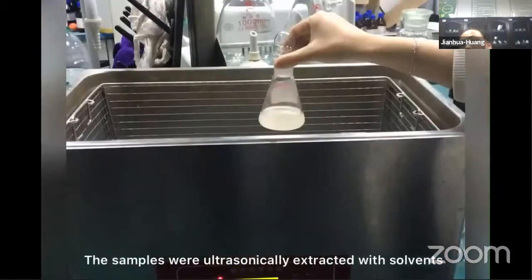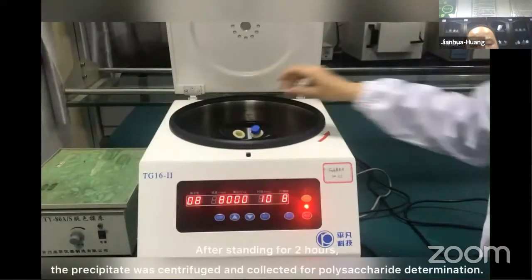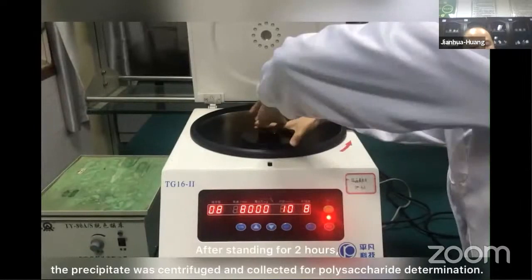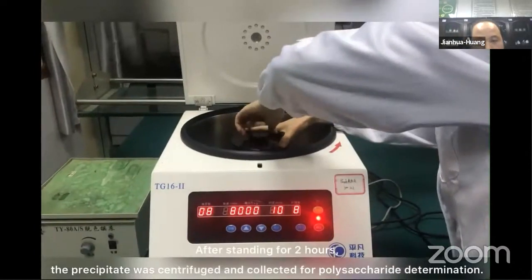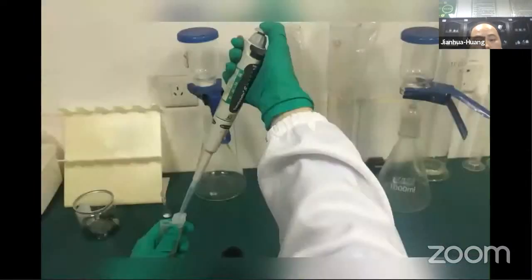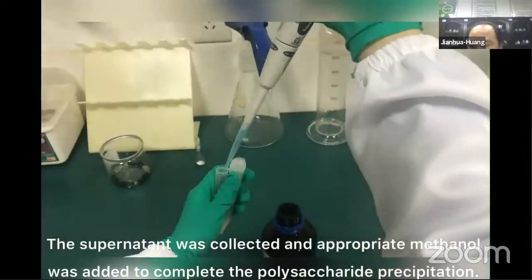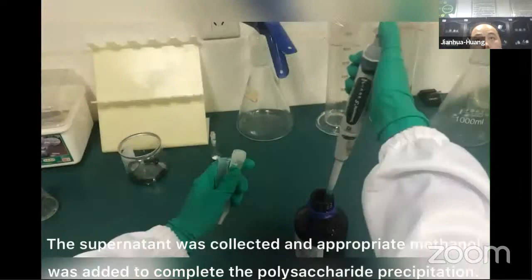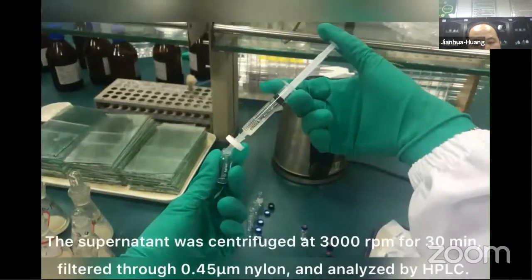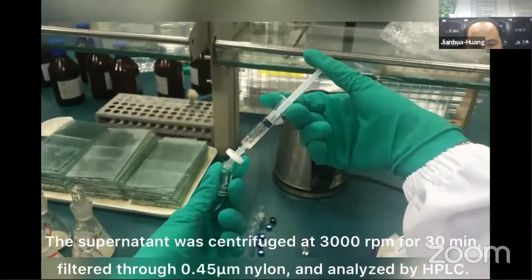The samples were ultrasonically extracted with solvents. After standing for 2 hours, the precipitate was centrifuged and collected for polysaccharide determination. The supernatant was collected and appropriate methanol was added to complete the polysaccharide precipitation. The supernatant was centrifuged at 3000 rpm for 30 minutes, filtered through 0.45 μm nylon, and analyzed by HPLC.